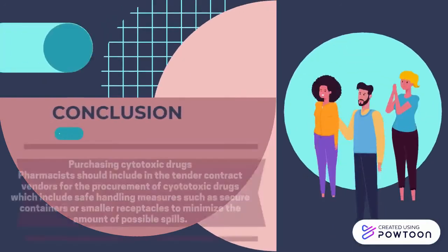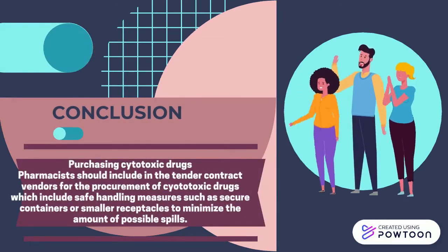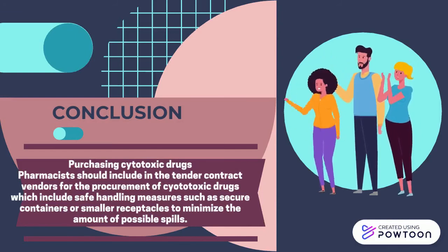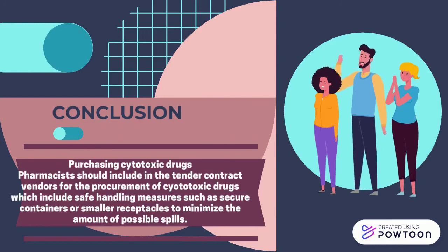Third, purchasing cytotoxic drugs. Pharmacists should include in the tender contract with vendors for the procurement of cytotoxic drugs safe handling measures such as secure containers or small receptacles to minimize the amount of possible spills.